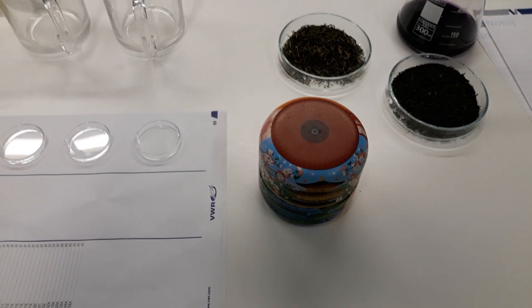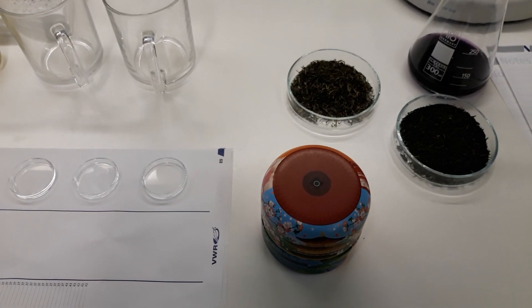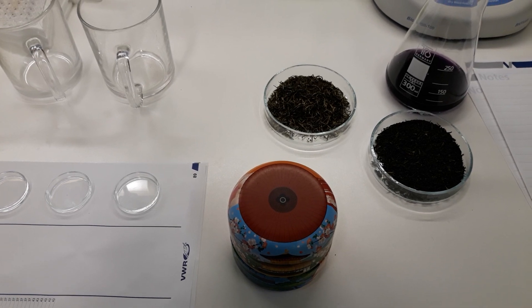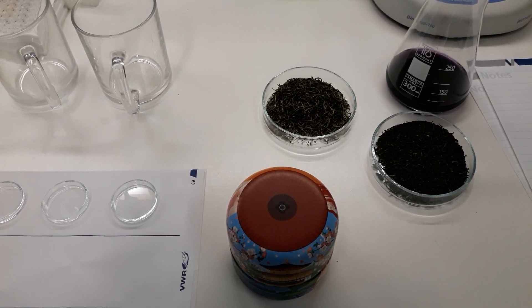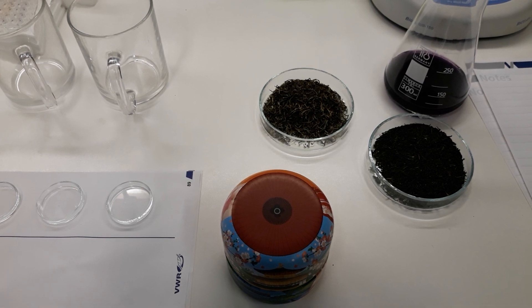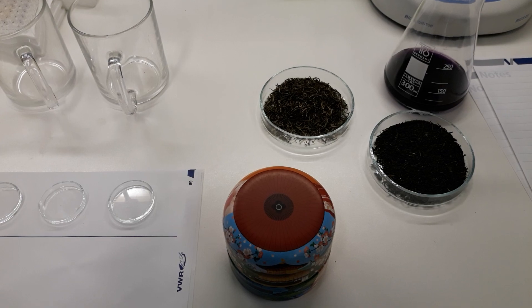Hey guys, this is Iman from Budapest. Today I'm trying to demonstrate some antioxidant power or antioxidant capacity of the green teas that I used to drink. I hope you enjoy this video as a complete cool demonstration of this reaction that we are doing in the lab.